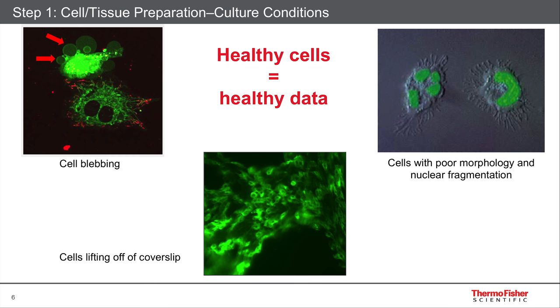Here are some examples of cells that aren't really in the best state to start with. In the upper left, for instance, you can see a couple of cells labeled with two fluorescent dyes. The cell at the top is unhealthy — you can see what's called cell blebbing, where the plasma membrane actually extrudes out into the media, a good sign that the cell is unhealthy or maybe has the wrong osmolarity. In the upper right are some cells that are probably going through apoptosis. They don't like the medium they're in; they're starting to shrink, and you see these weird processes around the outside. The cell on the left in that picture actually has nuclear fragmentation happening.